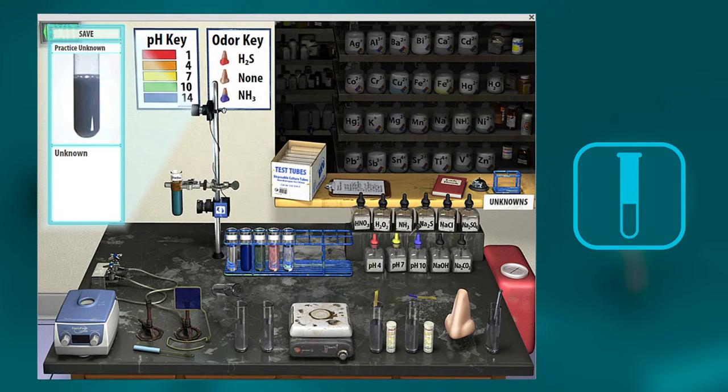What does that color tell you? So now we can centrifuge, decant. Okay, so what does that color tell you? What do you think you have there? Now let's test and see what you have in this tube up here. What were the steps we did for that? The color changed. Have you seen that before?